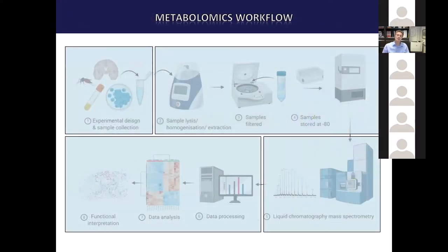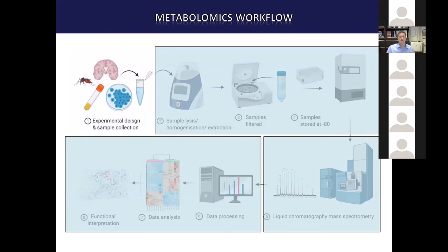Okay, so moving on to the workflow. I just wanted to go through the workflow that we use in our lab, just to familiarize you with the process. And it's in four parts really. The first, of course, is what it is you look at, so the samples themselves, and also how you then design the experiment. The beauty of metabolomics is you can look at so many types of sample, and you can think of an infinite number of very interesting types of experiments.